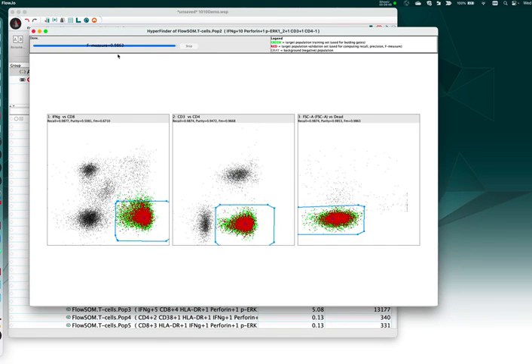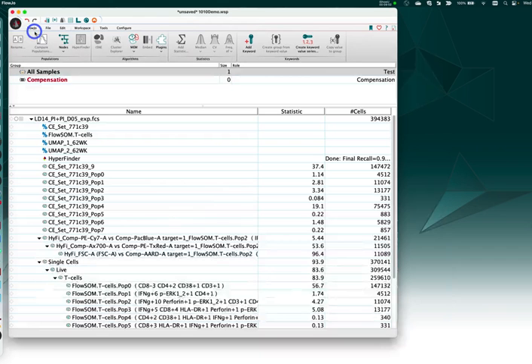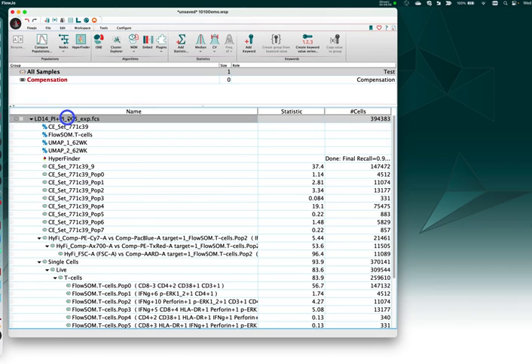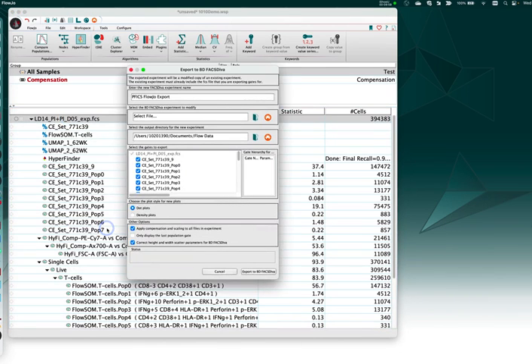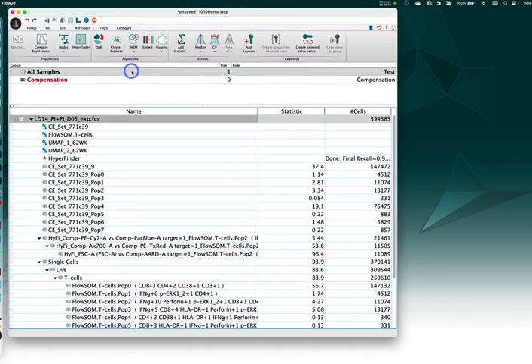So to recapitulate that population that was found via clustering, we needed three gates. If I close the HyperFinder tool, I will see those three gates. I could, if I want, either export to BD FACSDiva using this tool here, or hit save and open in the S8.